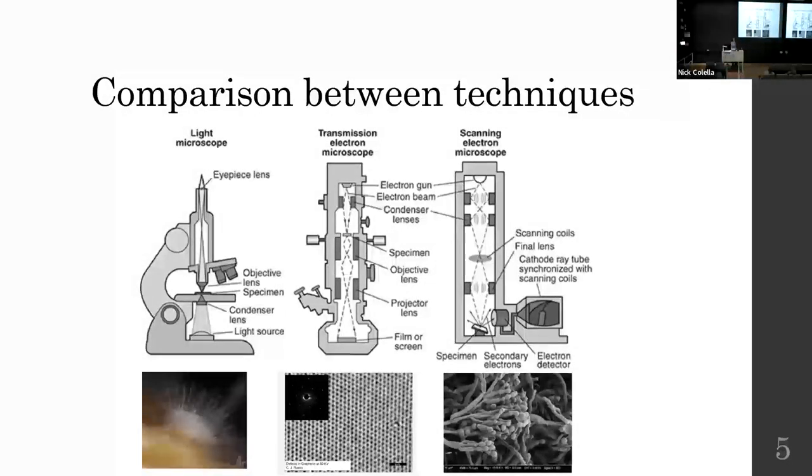So this is a slide that Tim actually threw up a couple of weeks ago now. And it's a nice comparison of the different microscopes that we typically think of using here. And they all have some common features. They all have a source, they all have your sample, they have a bunch of lenses, and then you're going to form an image and have some kind of detection mechanism. So if we compare the scanning electron microscope, you've got an electron gun at the top here, you've got lenses, then more lenses, and then it's focused down onto your sample, and then you've got a bunch of detectors. What's shown there is an Everhart-Thornley detector, but you've got other detectors which are available to detect the signal that's coming off of it. In a TEM, slightly different to that, we put the sample halfway up the microscope. So we've got lenses above the sample and lenses underneath, and then we've got our detector at the bottom there.